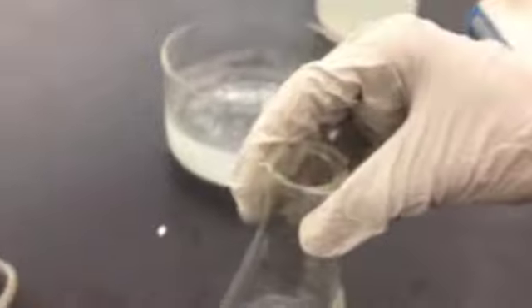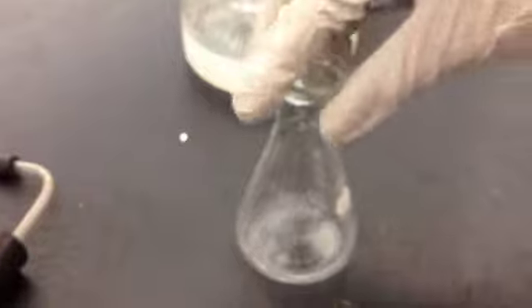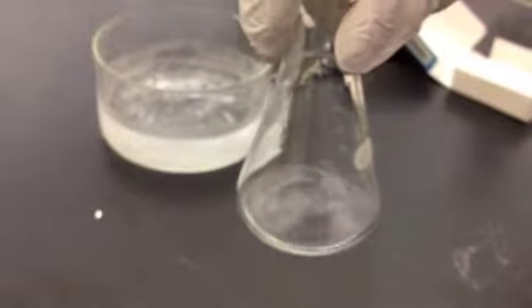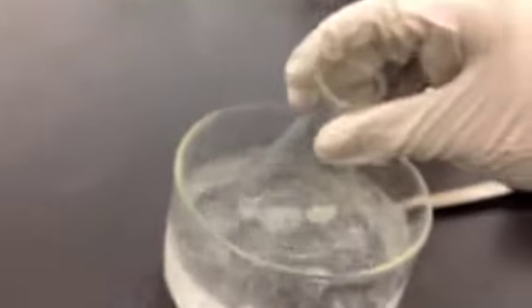So let's look back here. This is cooling down. It's still a little bit hot. You don't want to put it directly inside the ice bath. You want to let it cool down to room temperature first before you do that. If you immediately take it from the heating mantle and put it in the ice bath, the precipitate will be really fine, and we don't want that. We want it to be a little bit bigger crystals. So it's cooled down enough now. It's closer to room temperature, so we're going to put it in the ice bath.